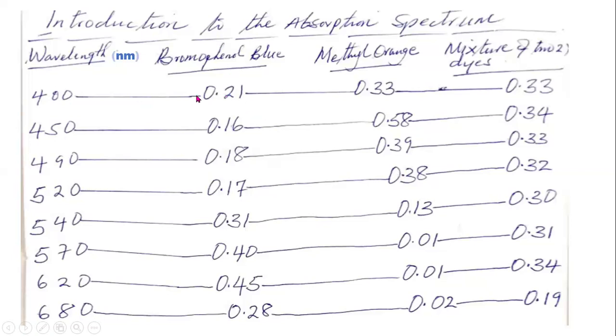You check the smallest value and the highest value you have. We have 0.01, so you take note of that. 0.01 is the least value, and the highest value is, I think, 0.58. Yes, okay. So you take note of that in constructing your scale so that you have a good plot. We already did that.